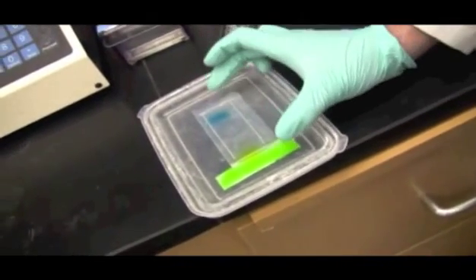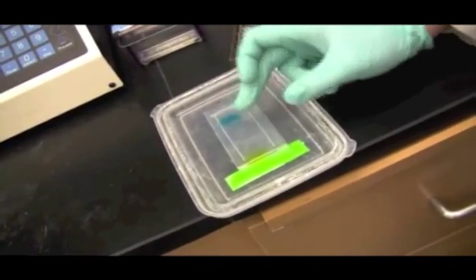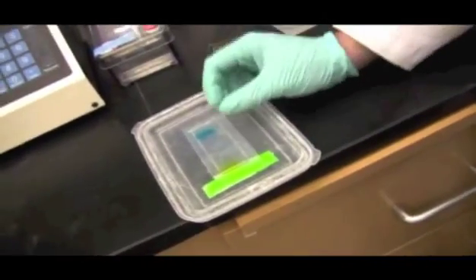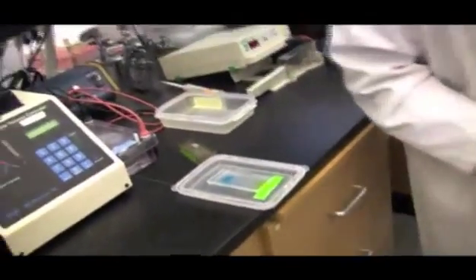And so what I need to do is cut out just our piece of DNA that we're interested in. And so I can't exactly show you an image of this, but there's a way that we can put this in a machine and mix a molecule in here that will bind onto DNA, and just like our glowing molecule we had earlier, it will glow as soon as we see it. So I'm going to show you guys a picture of what this gel image would look like if we could see a picture of it. So I'm going to go over to the computer real quick and show you that.